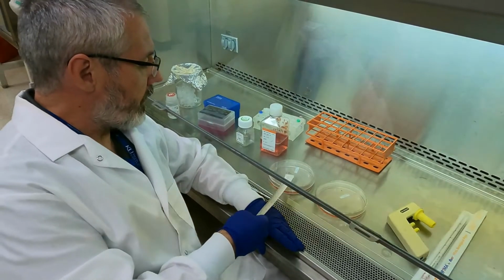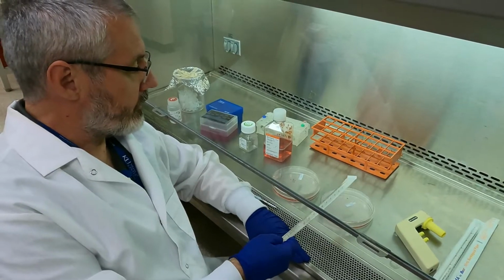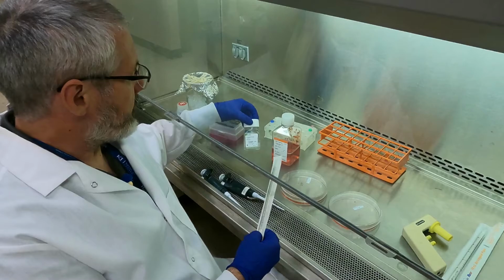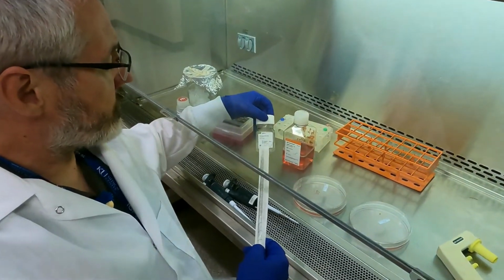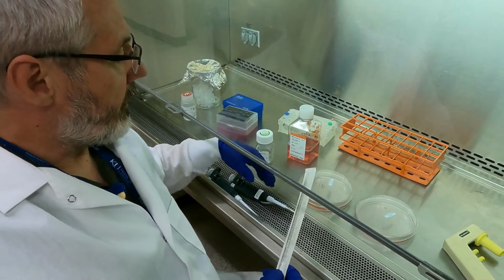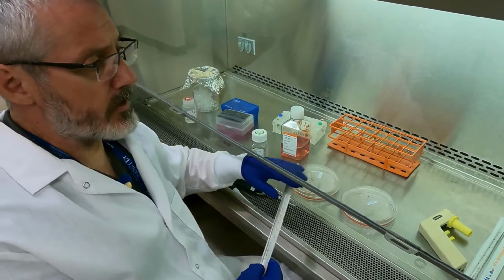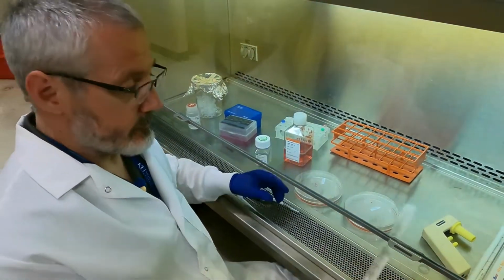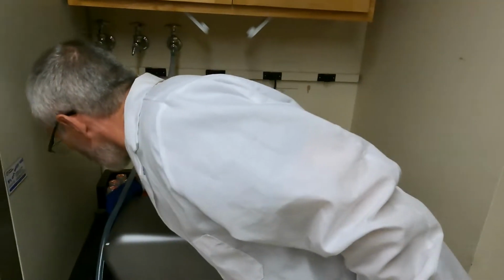So I'll get on and wash these and elute them, get them off the plastic with trypsin EDTA, and then get them in suspension, spin them down and get them up in PBS, and then we'll count them. So I'll do that right now. There's a Neon system here, and I'll just switch it on at the back.